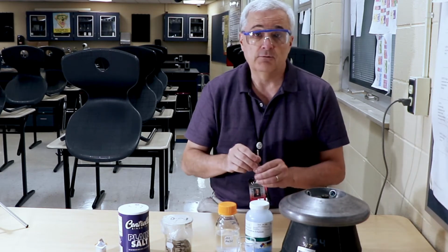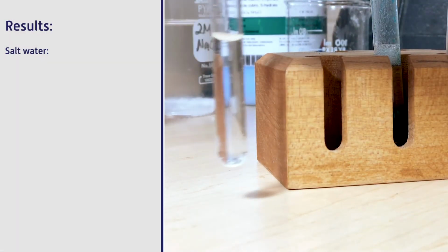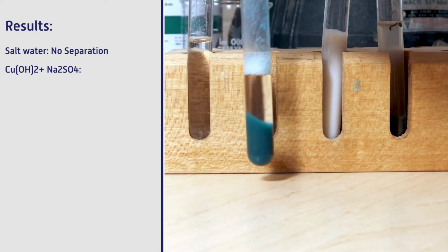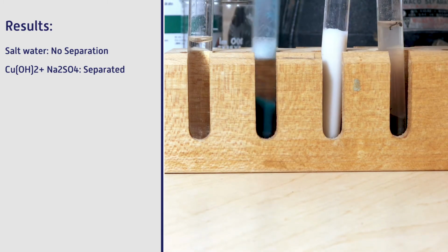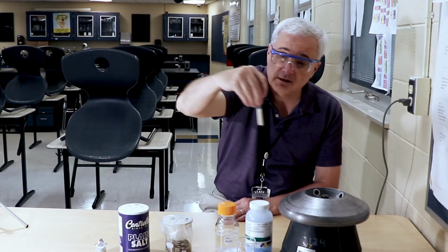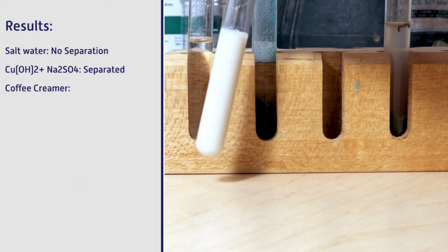All right, so this is the results section. So first up is the sodium chloride in water, and there is no separation. There's no separation in this sample. So the result on this would be there was no separation. All right, now this is the copper hydroxide sodium sulfate mixture here. And the copper hydroxide sodium sulfate mixture did separate into layers. So in your results, you're going to mark that as separated. And now we have the coffee creamer. The coffee creamer did not separate.